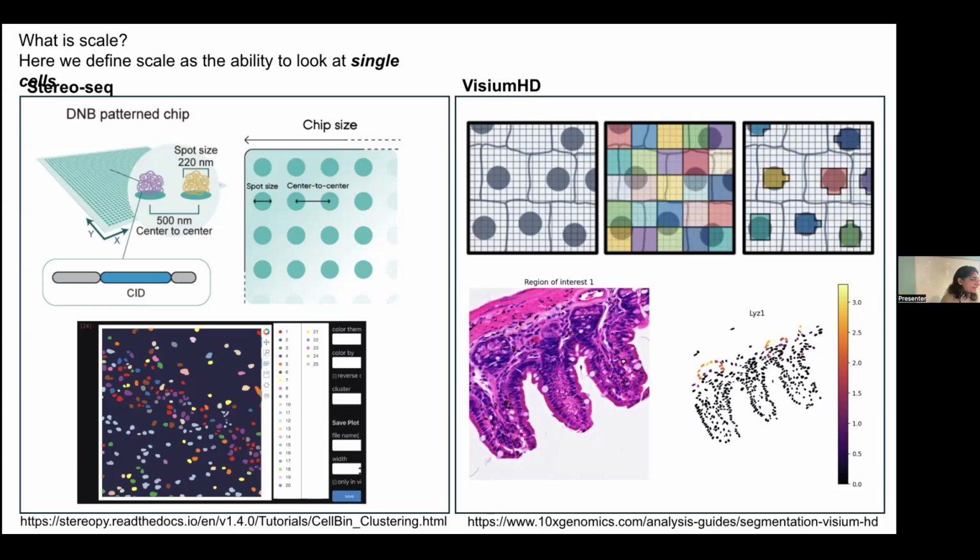We all know that tissues change very, very quickly, even if they are 5 micron thick slices. Especially for myself, I work on GBM. It changes so fast, I wouldn't even bother to expect that the nuclei are going to overlap. So just know that all of this is going to be an issue and something for you to consider, especially when it comes to spot-based assays.